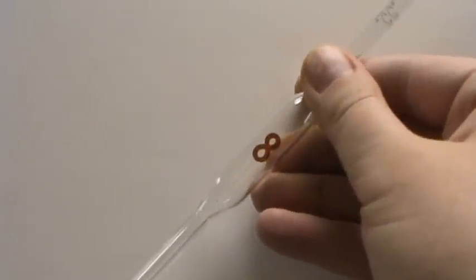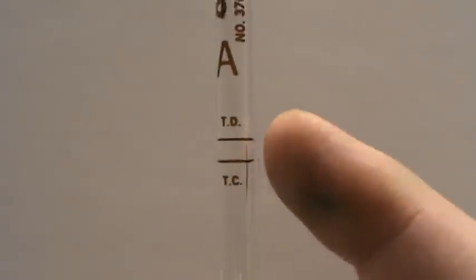and we've got a bunch of writing at the top. But what's going on with that calibration mark? This pipette has two calibration marks. If you look at that top one, what does that top one say? It says TD. So if we bring liquid up to this top calibration mark, this pipette will deliver 8 milliliters of liquid.